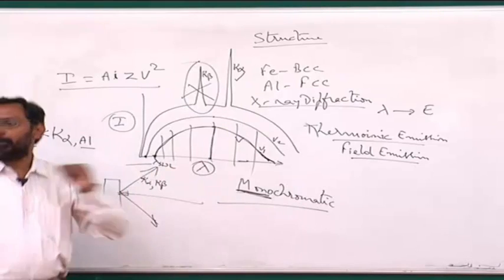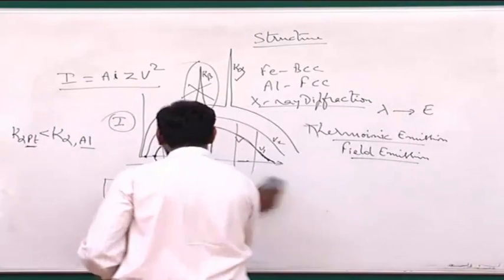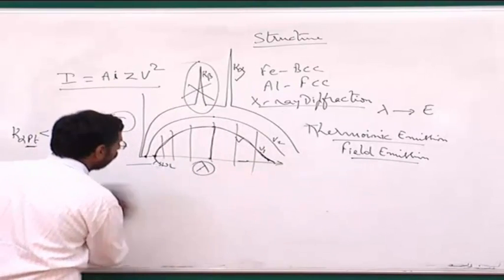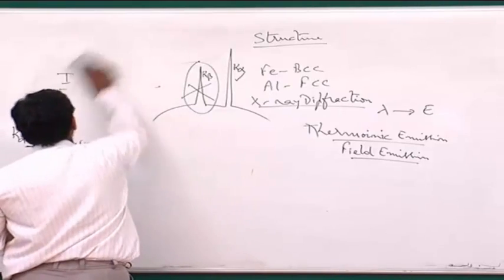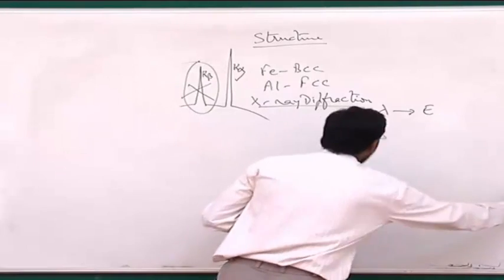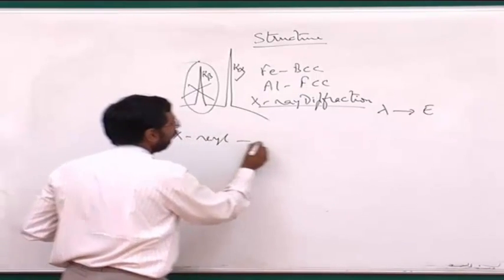And how do I do that? In that connection, people have found that there is a concept which makes this possible. And that concept is called absorption. People have found that when X-rays fall on a sample, they are absorbed.